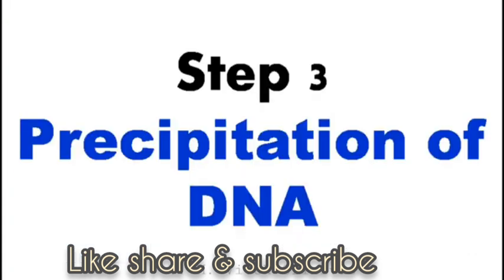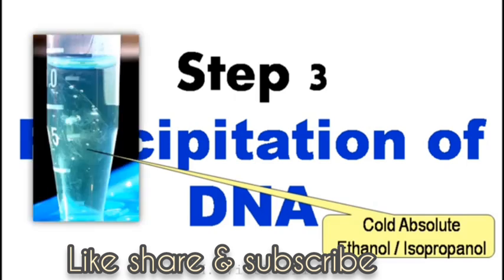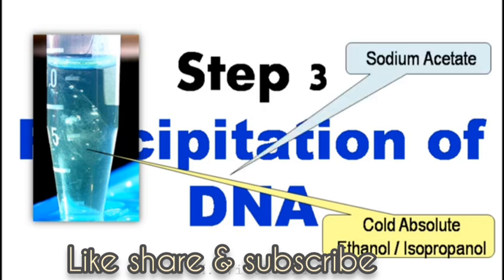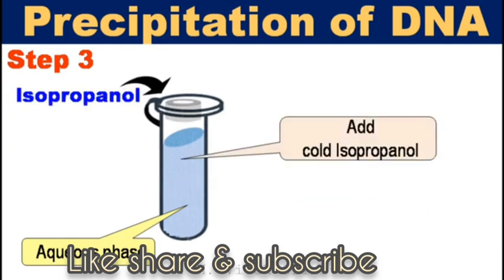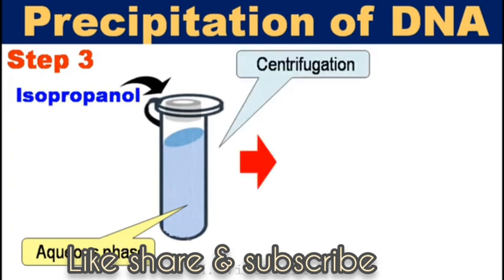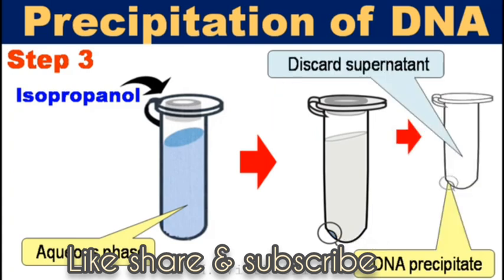RNA can be broken down by adding an RNase enzyme to the collected aqueous phase. Step 3. Precipitation of DNA, by using cold absolute ethanol or isopropanol. Generally, the DNA is insoluble in these alcohols, so they will aggregate together, giving a pellet upon centrifugation. Precipitation of DNA can be improved by adding sodium acetate. So, in this step, first add 100 microliter of 5 molar sodium acetate to the supernatant and mix gently. Then, add 2 ml of isopropanol, and mix gently by inversion. After mixing, centrifuge at 5000 rpm for 10 minutes, to precipitate the DNA. Following precipitation, discard the supernatant.